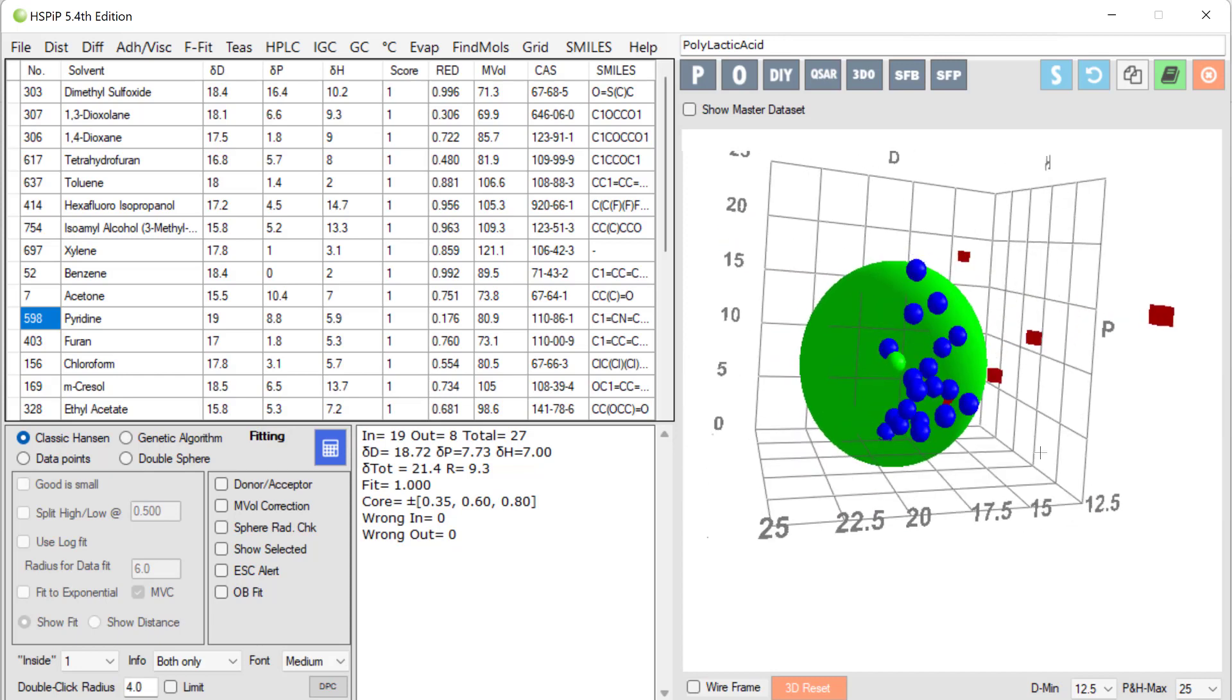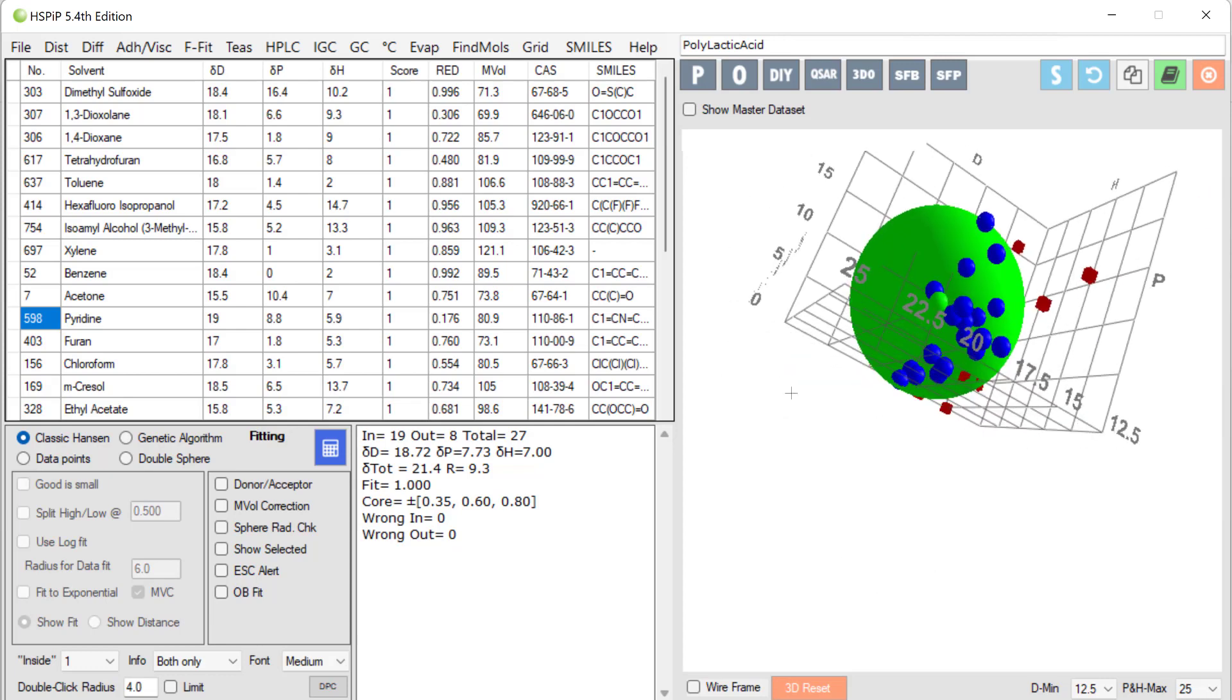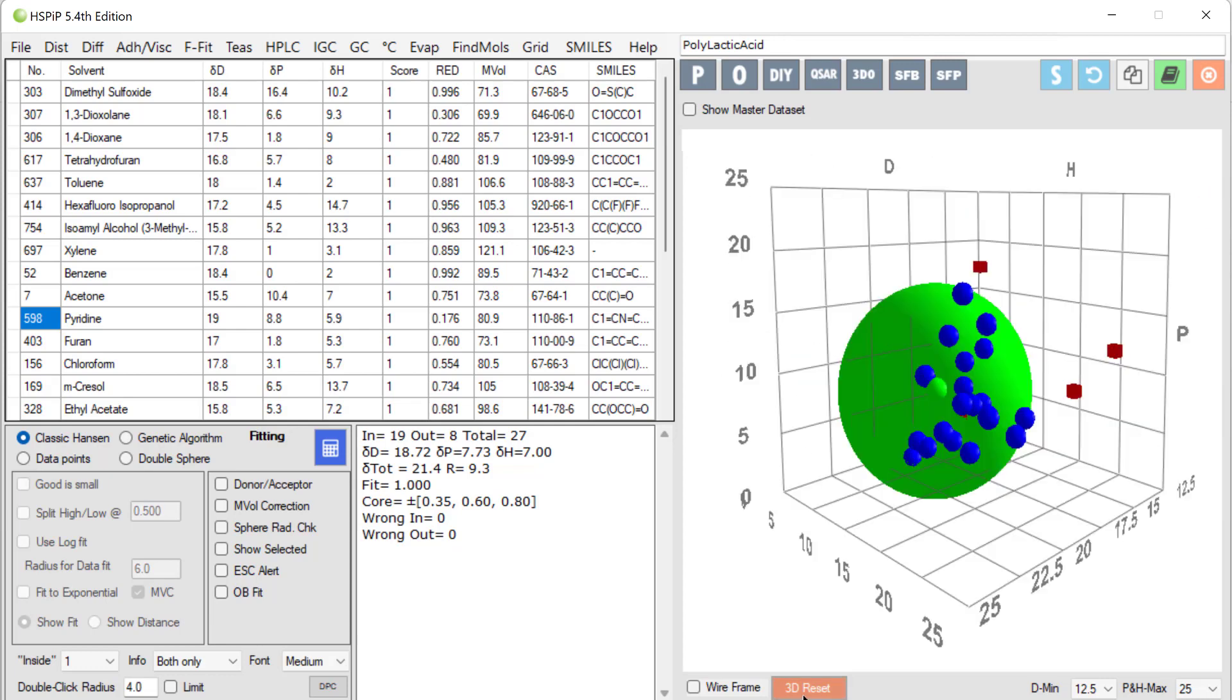And that's a unique fit in this case. One trick with HSPIP is that if you get lost in 3D space, you click the 3D reset button and you're back to a good view. So, as I said, the center is the HSP of PLA.